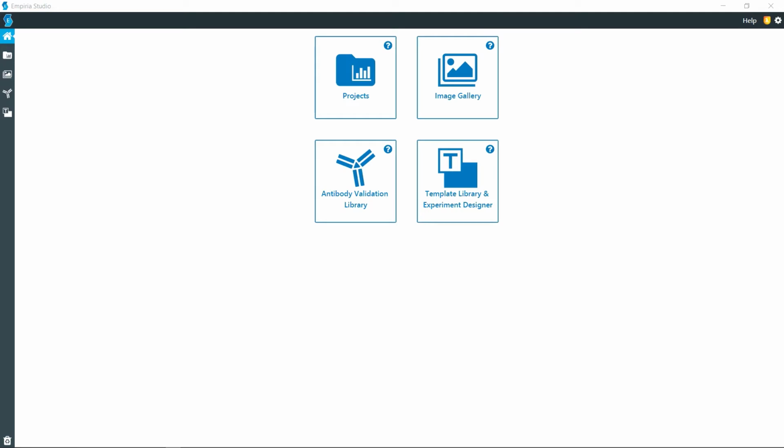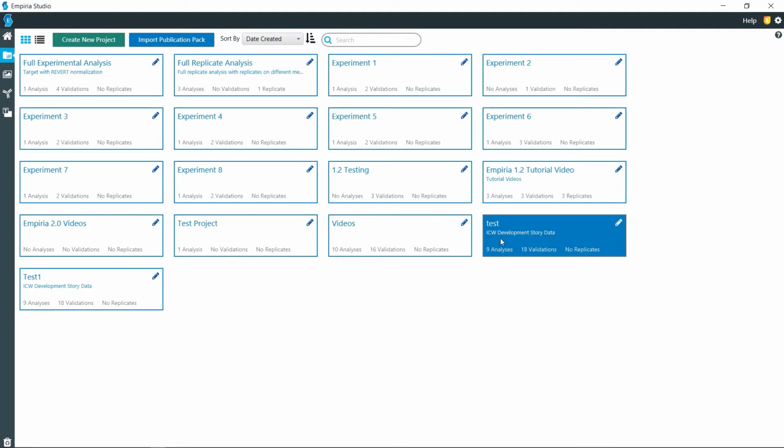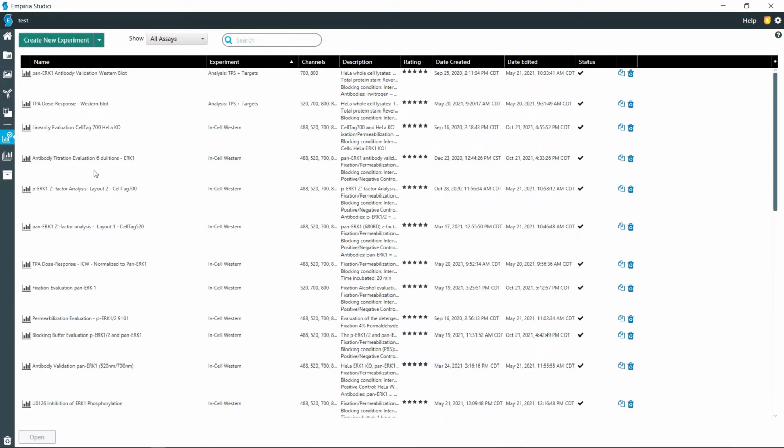In this video, I will be walking you through the steps involved with doing target analysis for In-Cell Westerns, ELISAs, and cell analysis. So we're going to open up a project here, and I'm going to choose an experiment that has already been started.